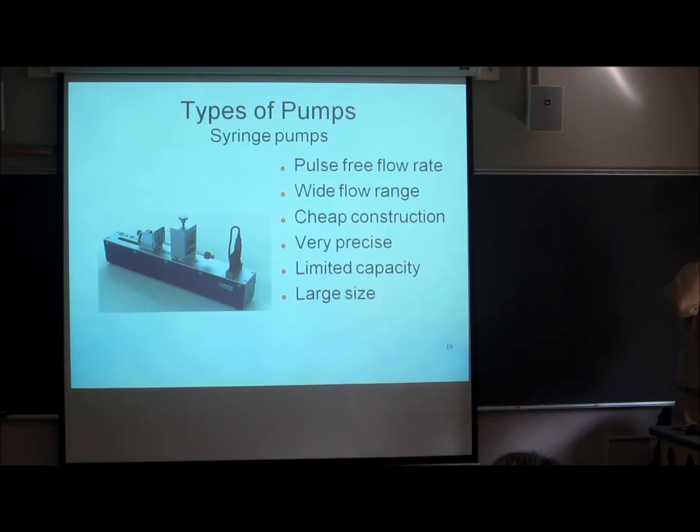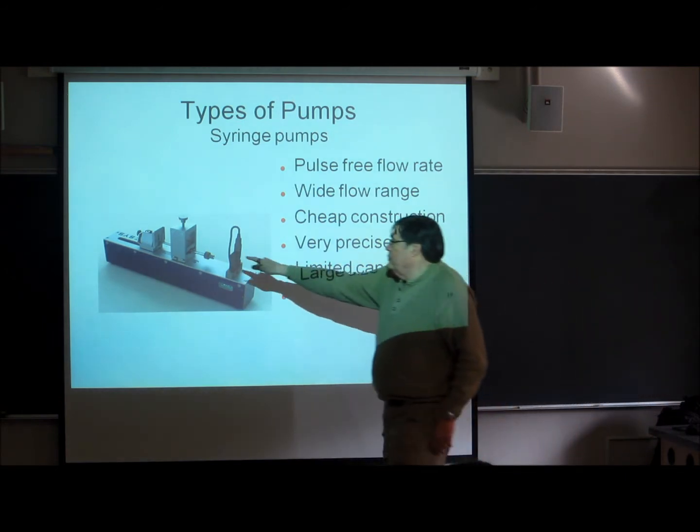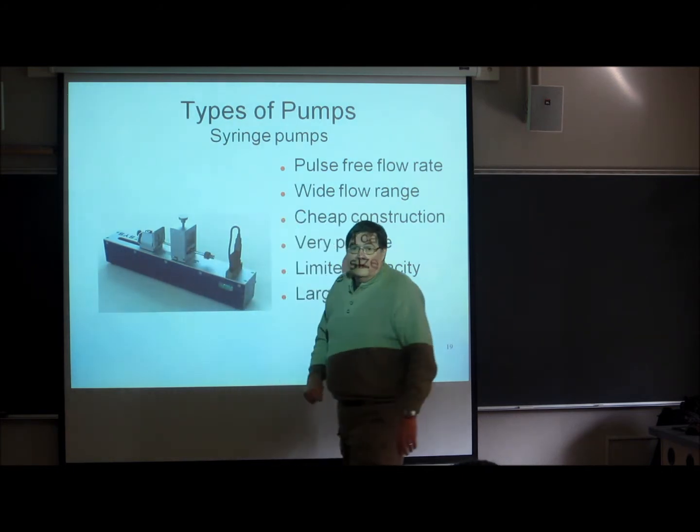This is a syringe pump. These are beautifully free of pressure changes. It's a nice linear motion. And you can drive this with a motor and a screw, fill up the syringe and then push the plunger in with the motor, and that pushes it into the stationary phase.